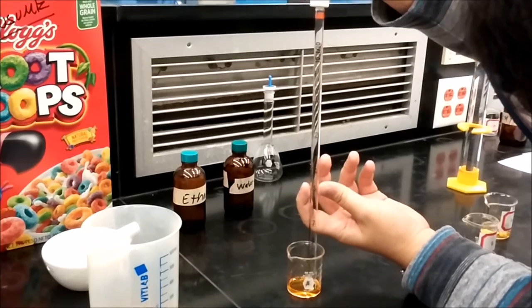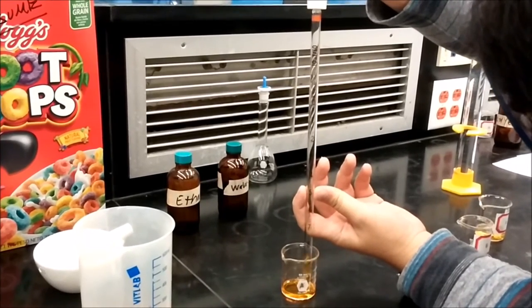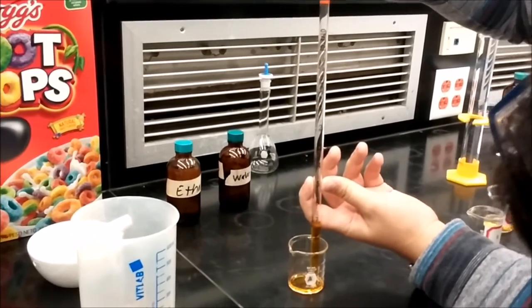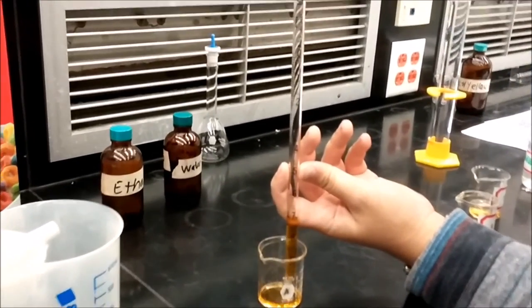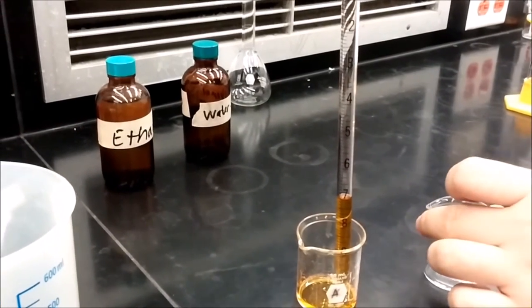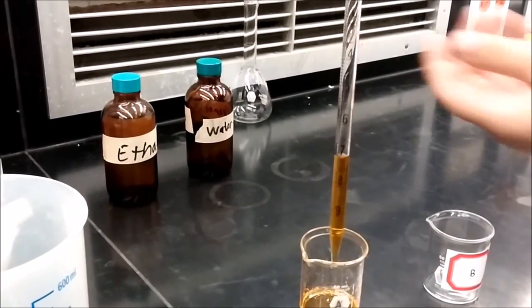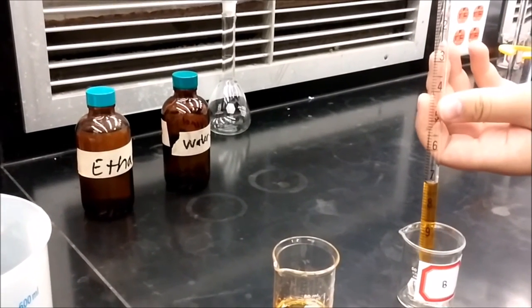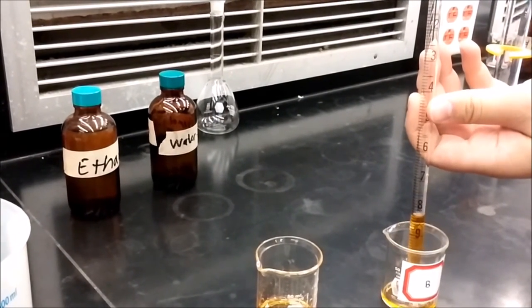Now that you have your wavelength, it's time to make solutions. Try and be as precise as possible with the graduated cylinders. The more accurate you are, the better your data will look for the post lab when you graph it. Take special care to try and get the exact measurements in your lab manual. Look at the meniscus on the pipette. It should be fairly obvious.